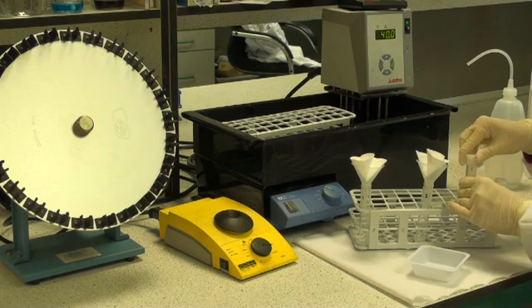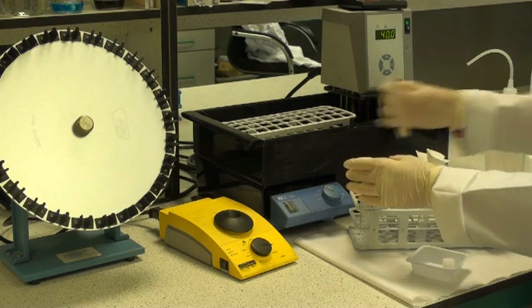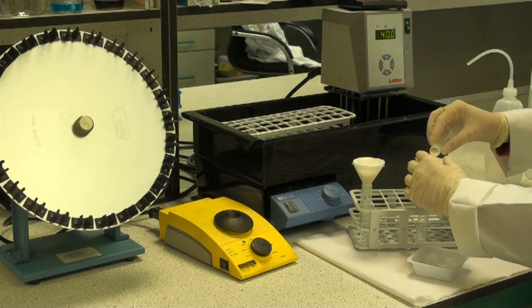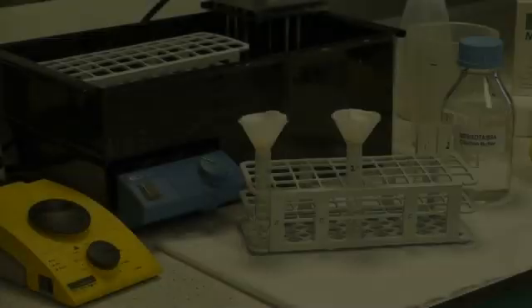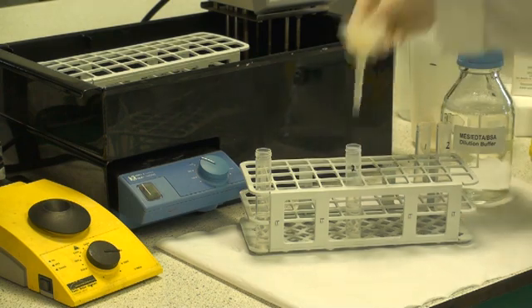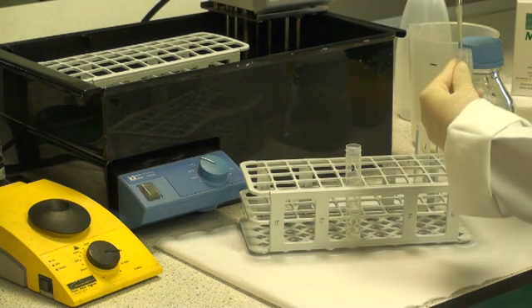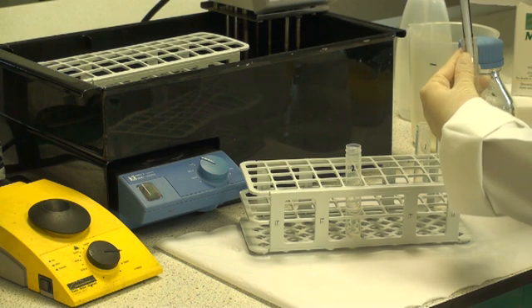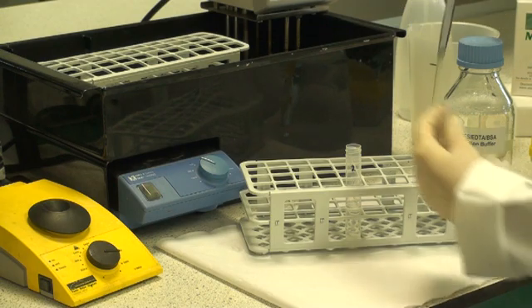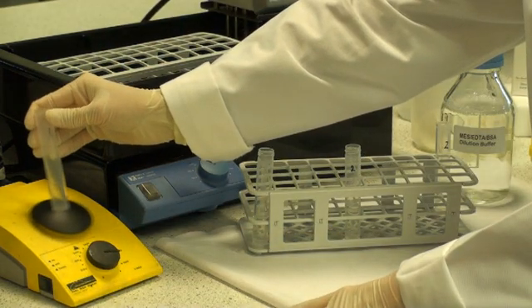Filter this solution through glass fiber filter paper. Remove the filter funnels and then transfer 0.2ml of the filtrate to 4ml of dilution buffer. Mix this thoroughly and this solution will be used in the assay.